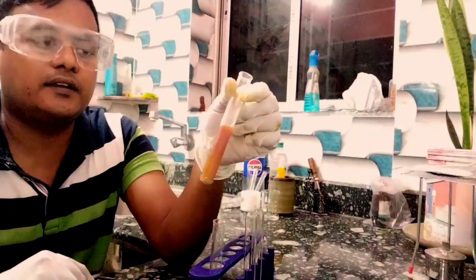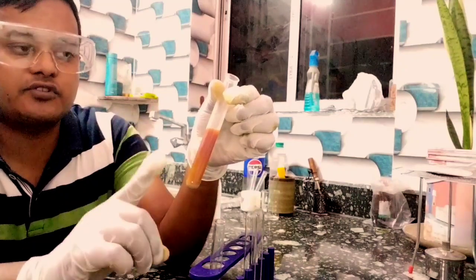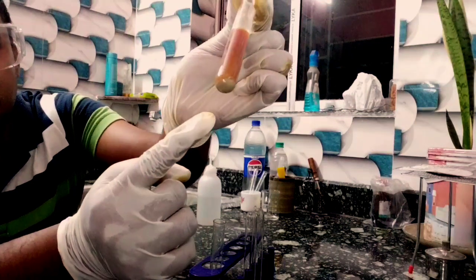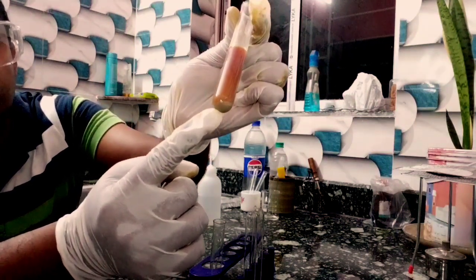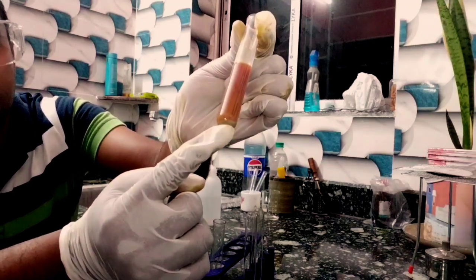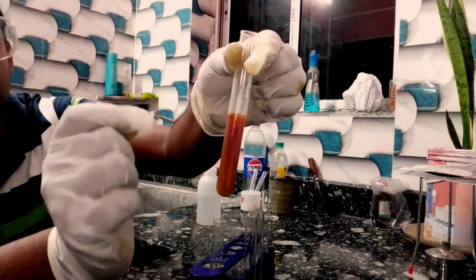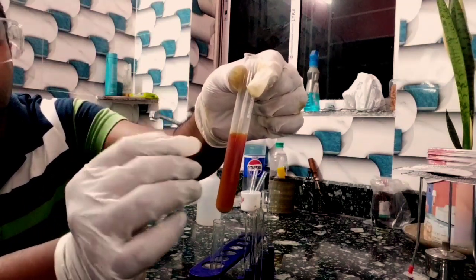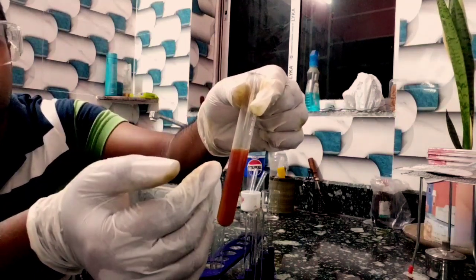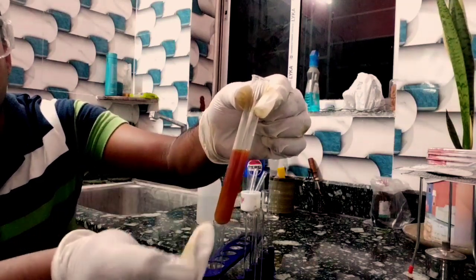See, here I added KI solution to CuSO4 aqueous solution, and the KI is also aqueous. See, in the lower part, the off-white cuprous iodide has settled down. Cuprous iodide, Cu2I2. This solution is brown due to the iodine vapor, and K2SO4 is soluble and colorless, it dissolves in the aqueous solution, and this turns brown due to the iodine.